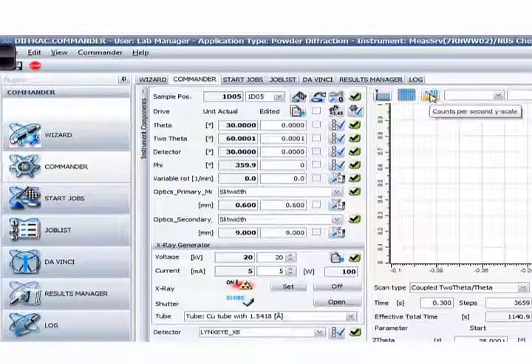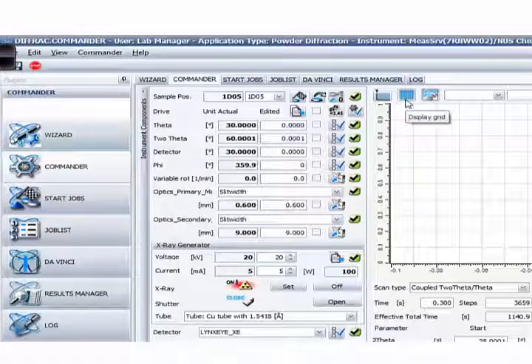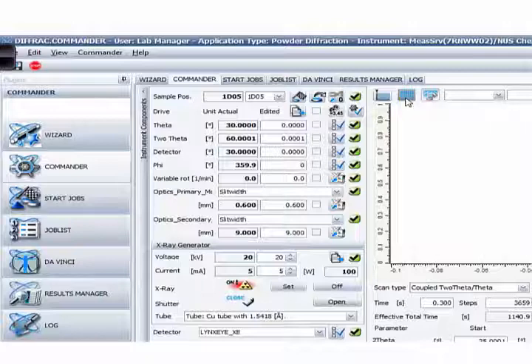This toggles between CPS and counts, and this is just to toggle the display grid on and off. All these green items mean the drives are being initialized. If any shows an exclamation mark, the drives are not initialized — but not to worry, because you won't be switching off this instrument and initialization is done automatically. Whenever you turn on the instrument, the system will auto-initialize before you come in. The old system did not do auto-initialization — this is an improvement.